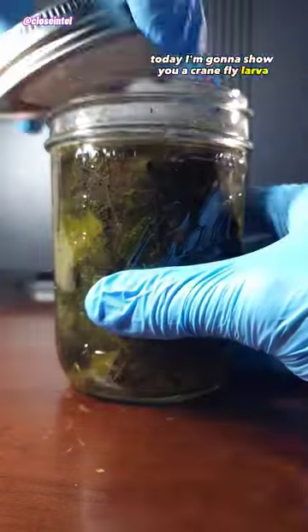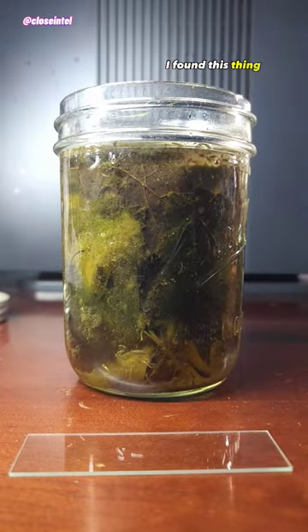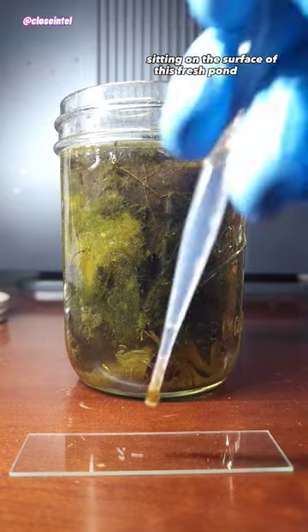Today I'm going to show you a crane fly larva under a microscope. I found this thing sitting on the surface of this fresh pond water I collected.